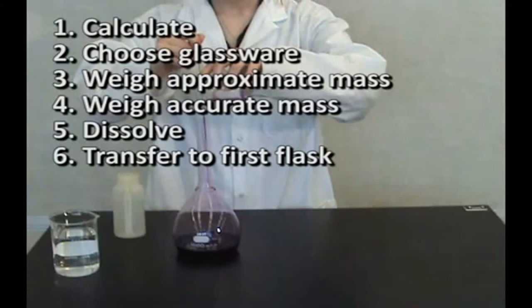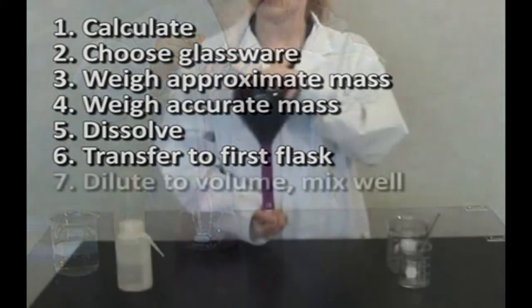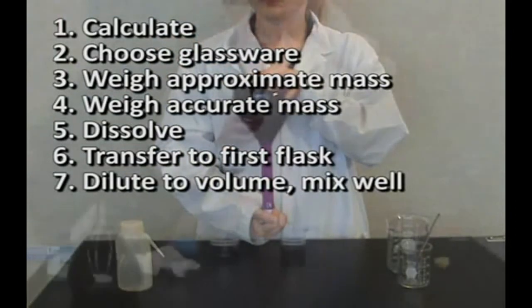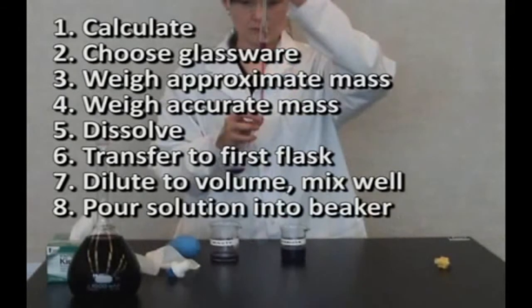Transfer to the first flask to be used in the dilution using the glass rod to pour. Dilute to volume, invert, and mix at least 15 times. Pour some solution into beaker.